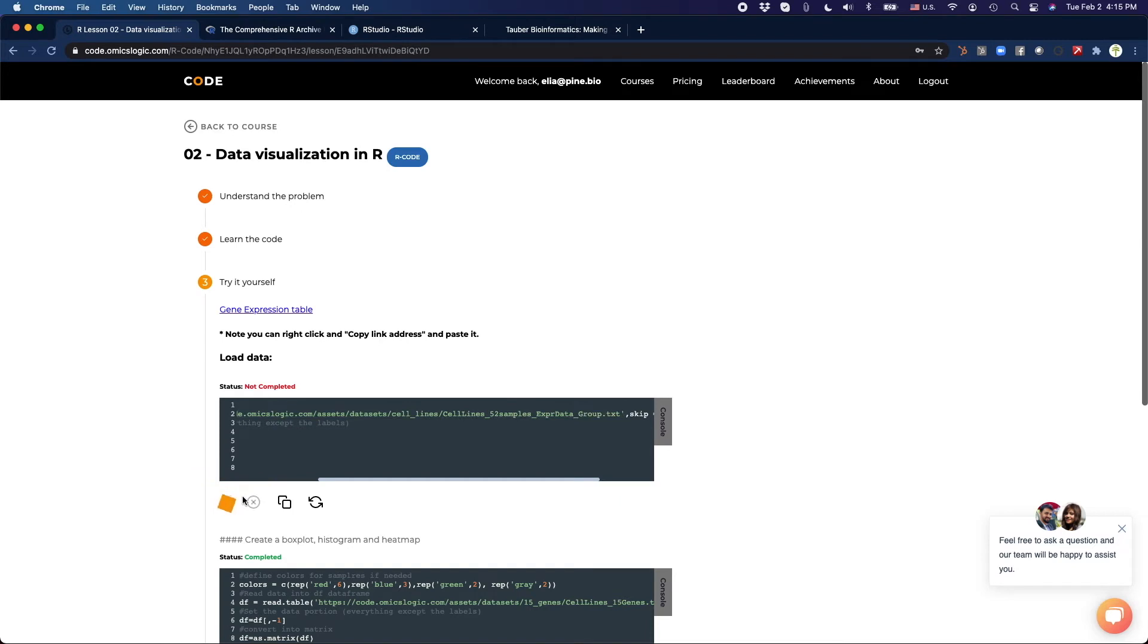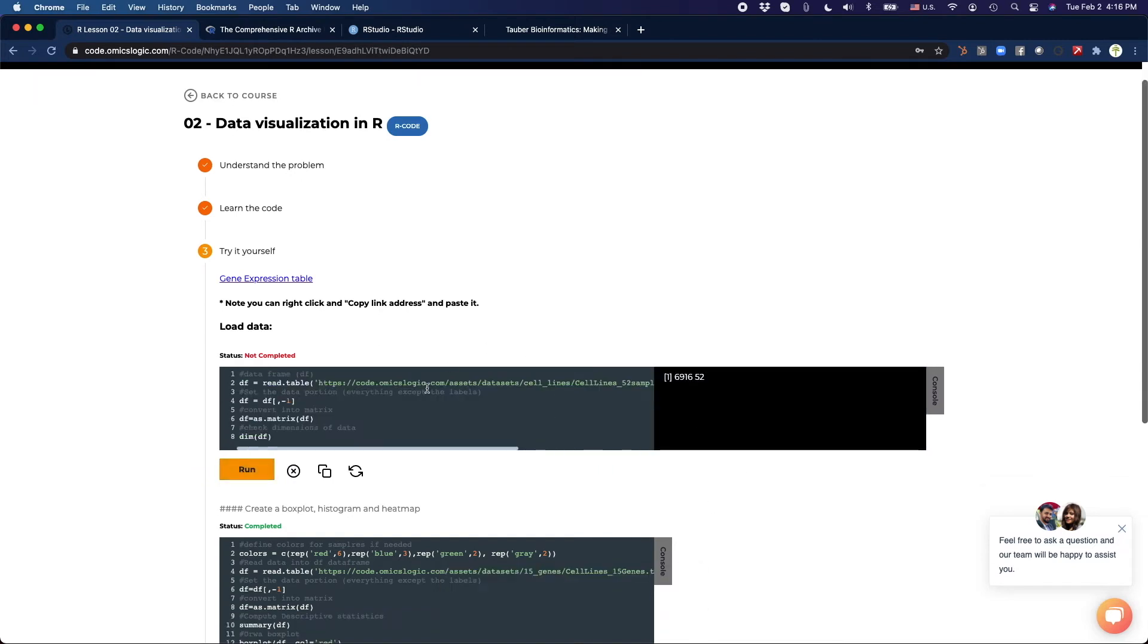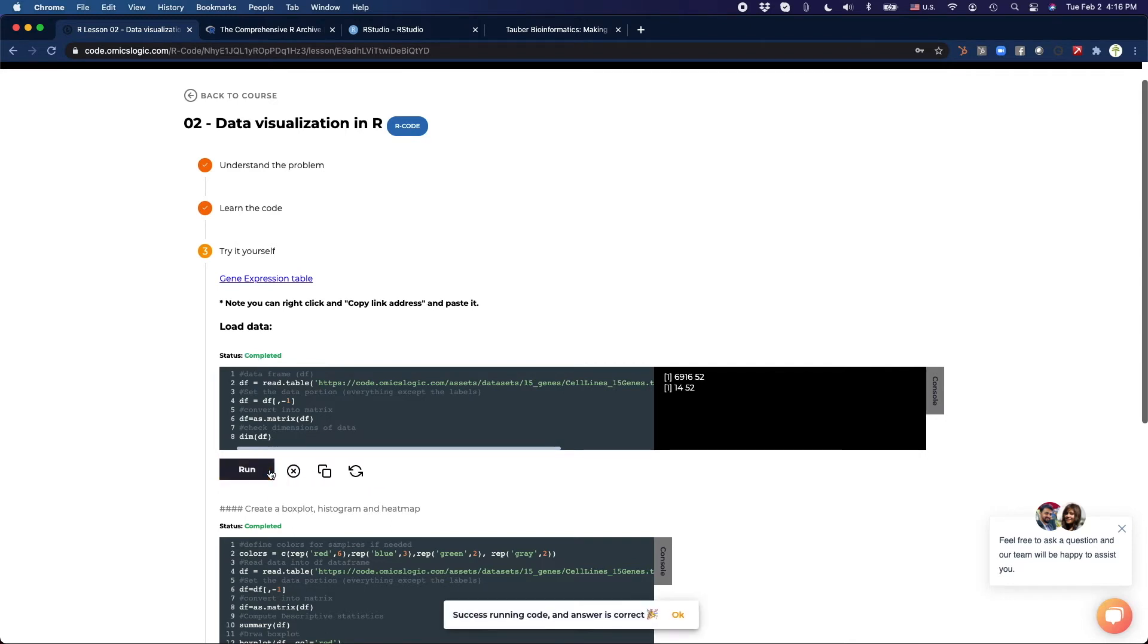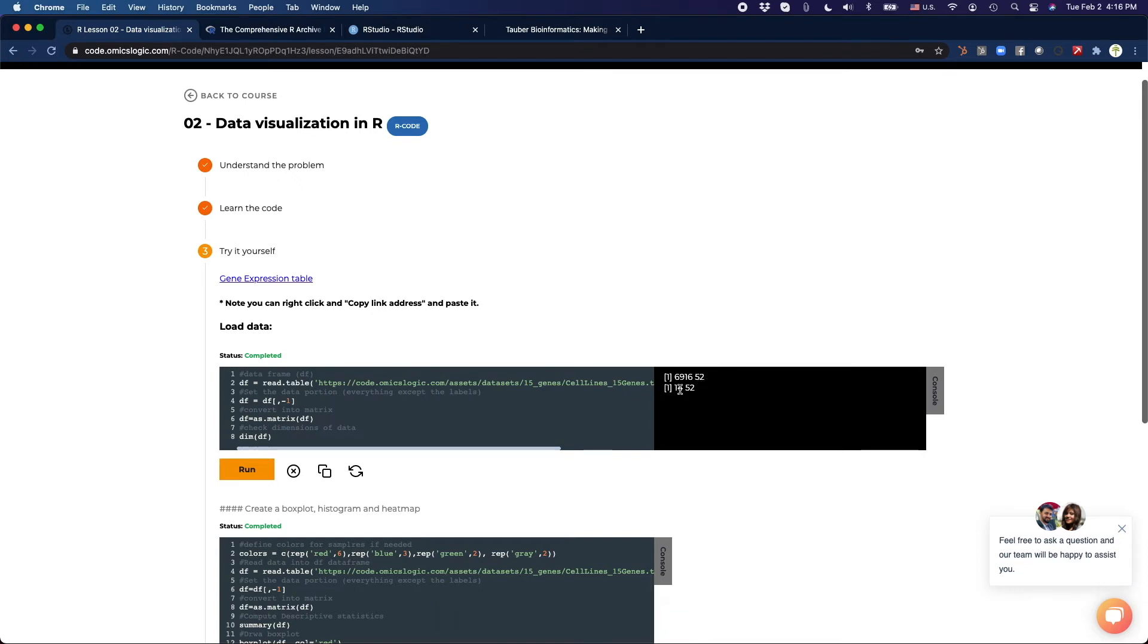Let's run it. If something goes wrong and I've messed up, I just need to press here, run it, and the answer is correct. So the data set that we were loading here was much smaller, 14 rows by 52 samples.